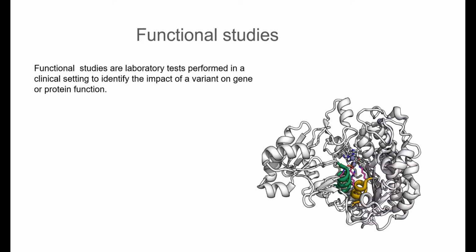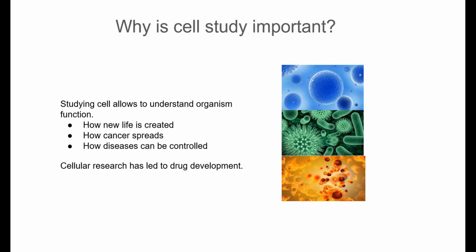So, this is a presentation on functional studies to investigate cell behavior in cancer. To start with, what actually are functional studies? Well, functional studies refer to a variety of techniques used to gather information about what might be the cause or the function of something. So let's say we're interested in the impact of a particular gene. We can do various things to upregulate it, downregulate it, knock it out, overexpress it, everything like that, and then we can actually observe these using functional studies.